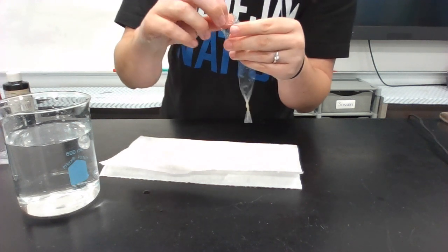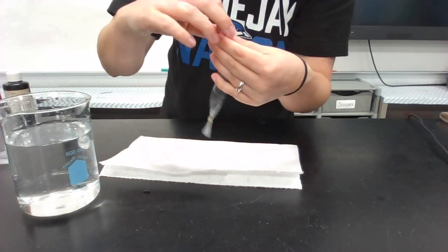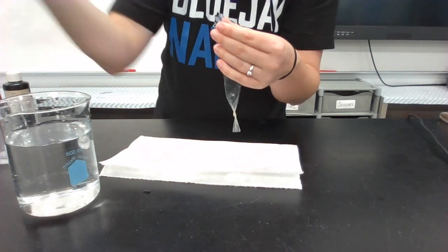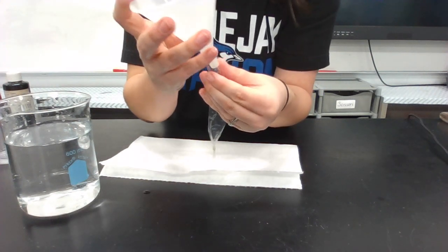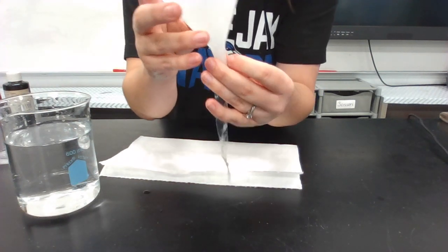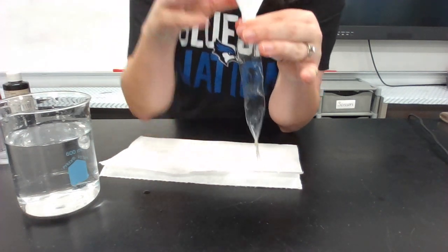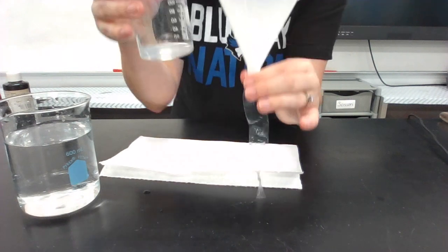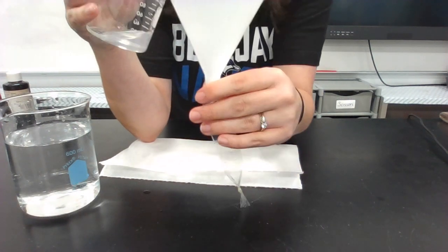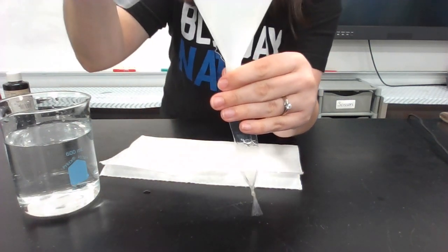So because I tend to make a mess, that's why I'm using my funnel. I'm going to grab that and I'm going to put it into the open end of that dialysis tubing so I can try not to make a mess. Then I'm going to take my 20 milliliters or so of starch solution and I'm going to pour it into the dialysis tubing.